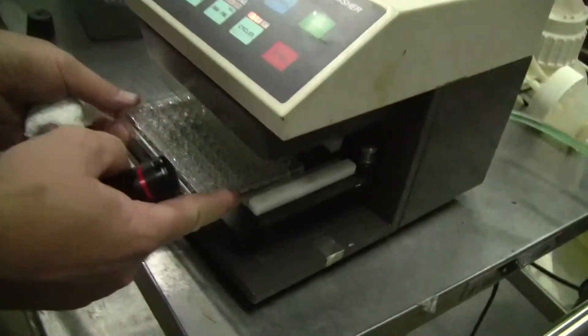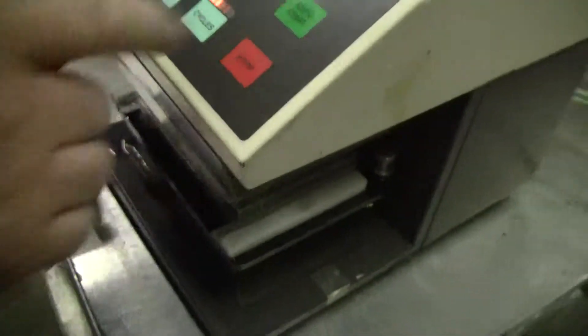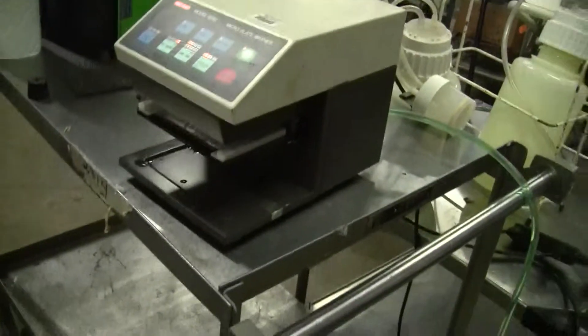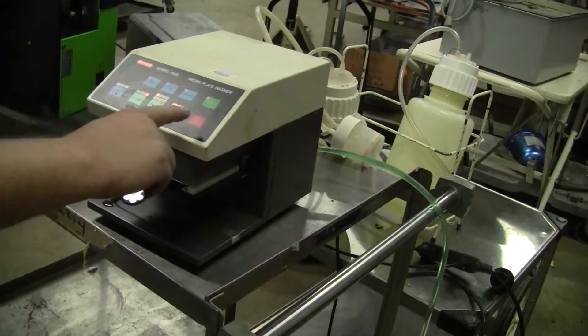All right, we're going to do it one more time. In the tray, I actually see some green. Some green in there, so we'll try it one more time. Hit auto start. Didn't seem to like that.